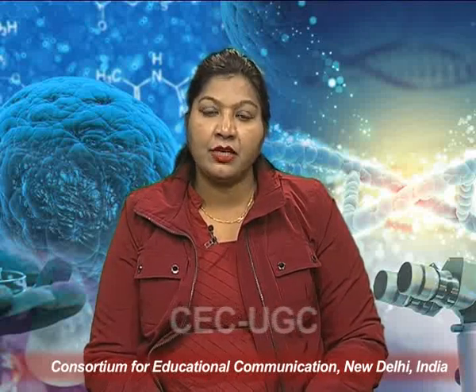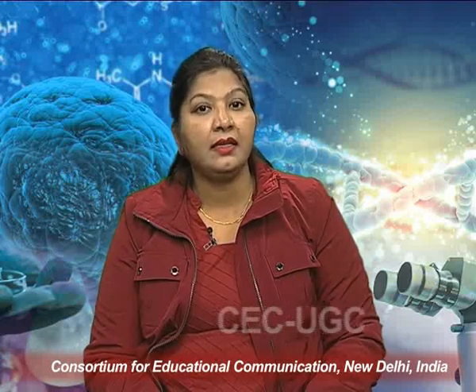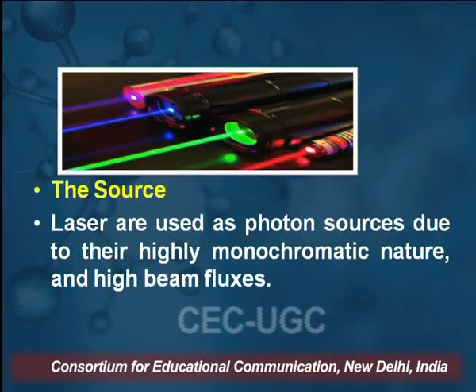Because the intensity of the Raman scattering varies with the fourth power of the frequency, we can use the argon or krypton ion source that emits blue and green light, which is near the region of the UV, and the spectrum has advantages over the other sources also. Now here we see the various green and blue sources we can use for Raman scattering.